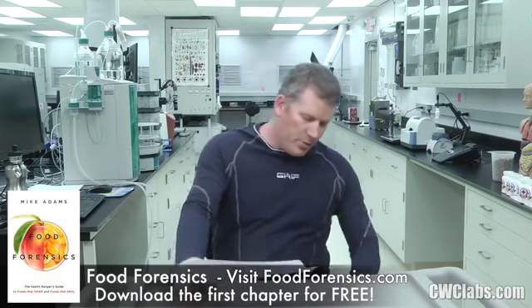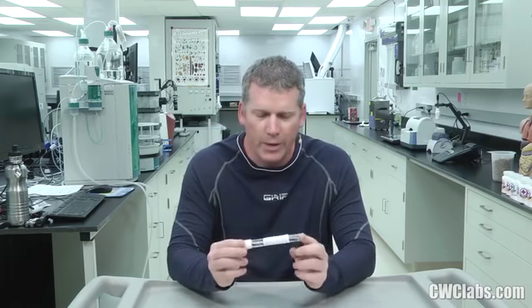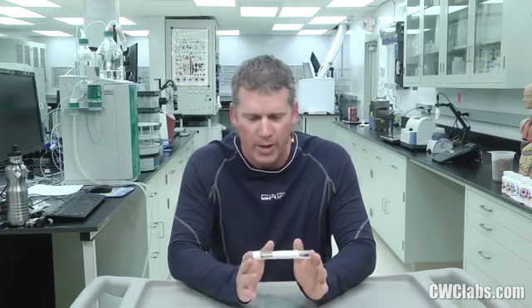So for this test, they send you a mystery liquid, and I have the vial right here. This is the vial, and it's a liquid, as you can see. See the air bubble in there? And this liquid, you have to tell them exactly how many parts per billion of cadmium and arsenic and mercury and lead are found in this vial. And they don't give you any hints, no clues. So you have to use your expertise, and that is one of our skills here at the lab, heavy metals analysis. You have to use that to tell them what the numbers are. And then they give you a pass or a fail grade.